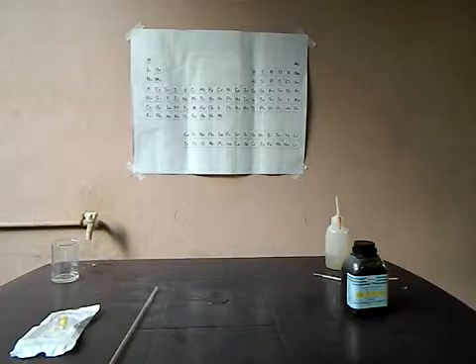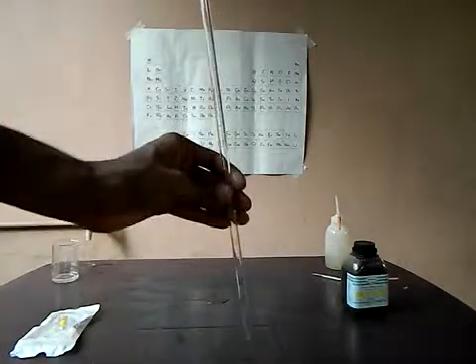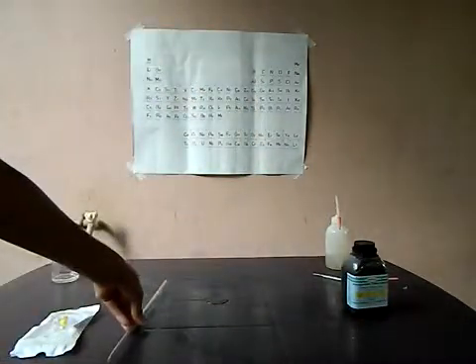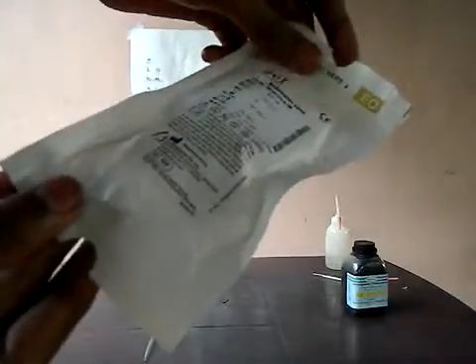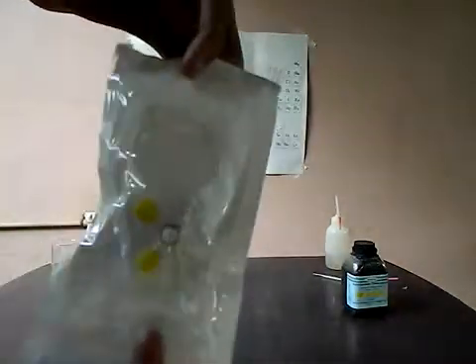For this we will require a graduated pipette — see the markings on it. And the important thing to account for is this: it's an extension line stopcock, prepared in New York.